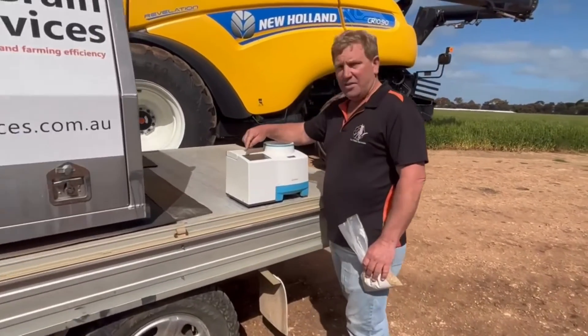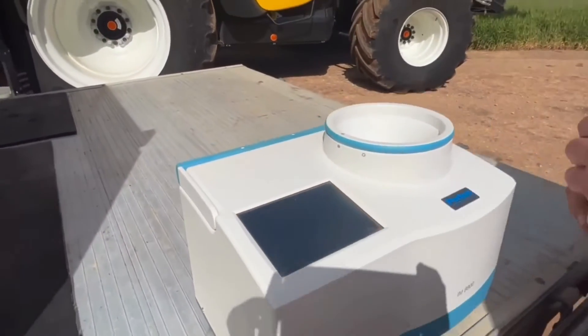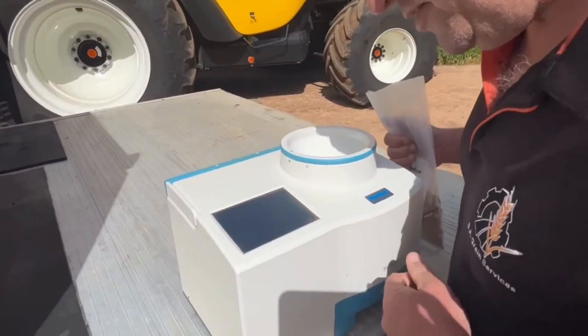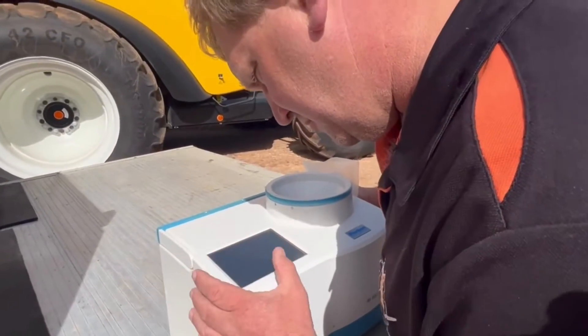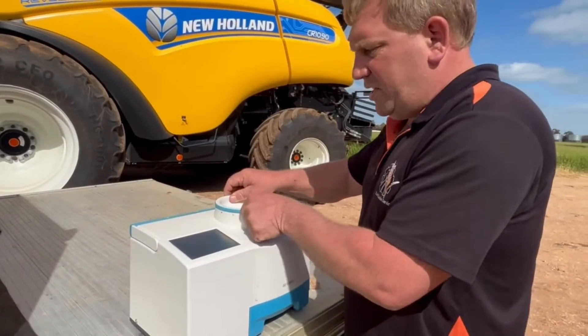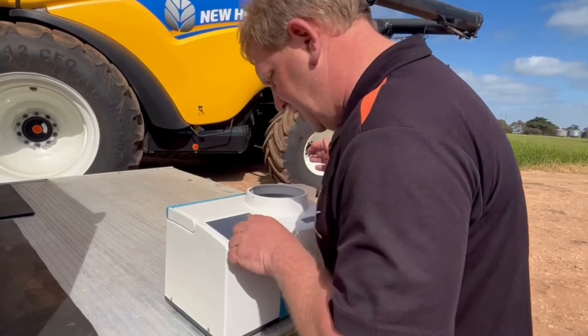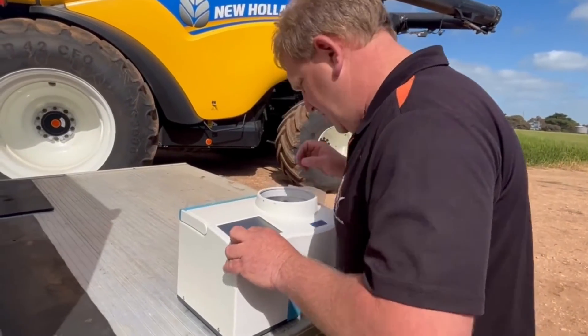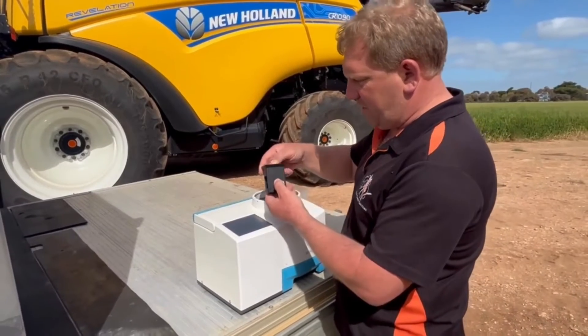Today we're going to sample wheat. On the touch screen you just press on wheat. It's asking me if I've got the right cell in, so I can check that. I'm going to say no for argument's sake, open this up and check — we need number 18 for wheat and barley.